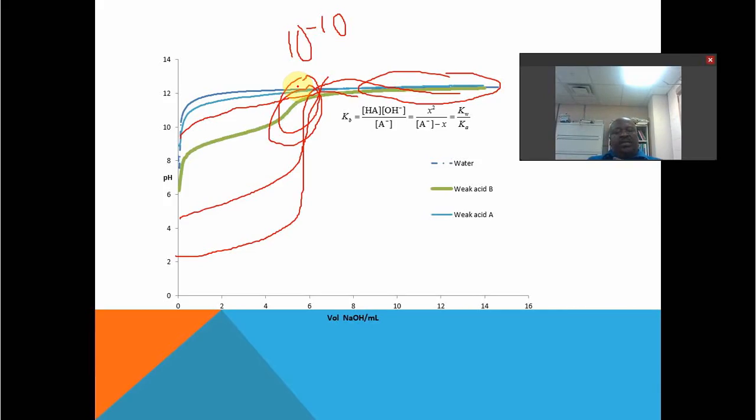So, that's the lab this week. Again, you do one titration and work through to the other titrations, so don't turn off the data loggers. And then the number of questions at the back, you want to work through those in class before you leave, so make sure that you're done all of those, because you'll need the support of your wonderful, smart classmates. As we learn better in a cooperative fashion, we help each other and we explain things to each other, that kind of thing.